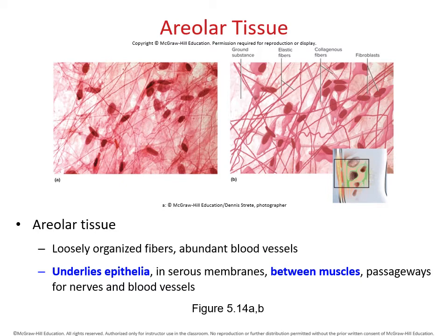And that's because in epithelium tissue, the cells are all connected to each other. So they like to make contact, they like to interact. In connective tissue, which is what we're looking at over here now, you're going to notice that the cells are very much spread apart, and there's going to be a lot of emphasis on what's happening in the matrix, in the background.